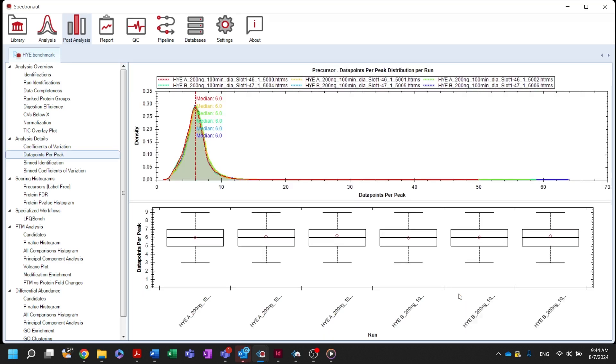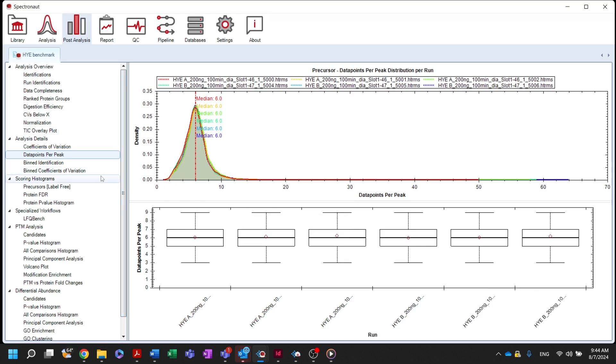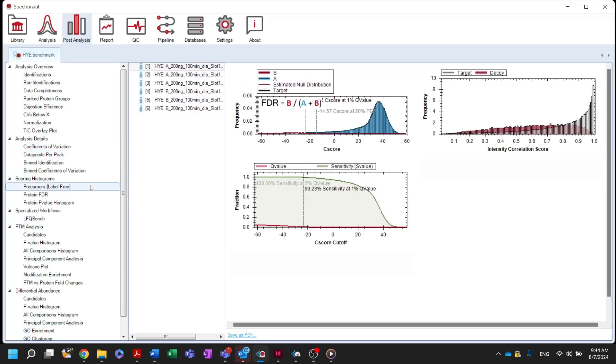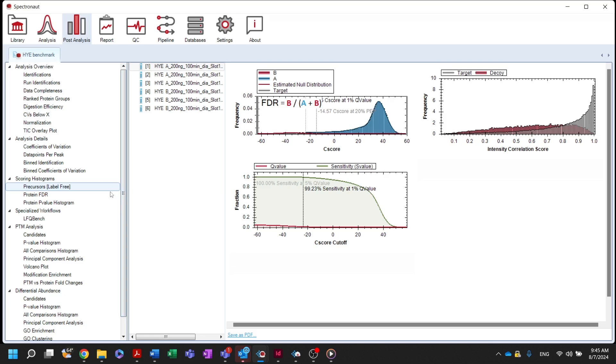Plots related to the behavior of the discriminant scores of the target and decoy distribution estimations can be found in the scoring histograms section. This behavior defines reported Q-values and sensitivity. The label-free node offers scoring histograms based on precursor scores for each run, while the protein FDR histograms are based on the protein group Q-scores.